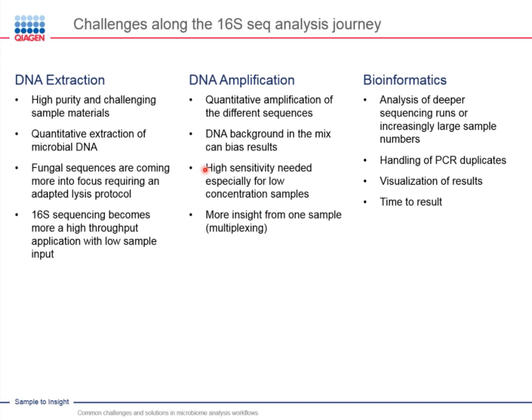So now you have done all your wet lab work, you have given your libraries to the sequencing facility, and then they come back to you with something like 20 or 60 or sometimes even more gigabytes of data, which for me as a biologist or biochemist is something I had no idea what to do with at the beginning. It's really a different world. I don't have a bioinformatics background, but you need this, or you need to have a good solution.